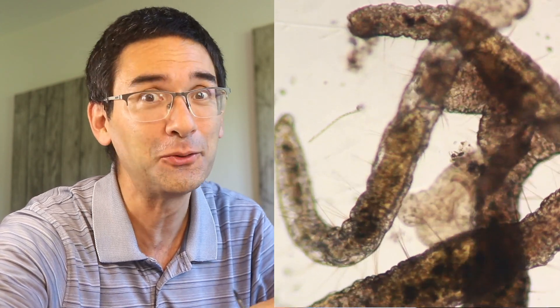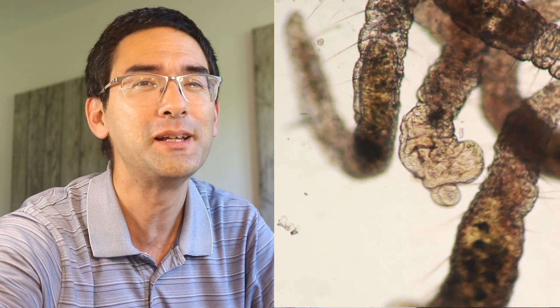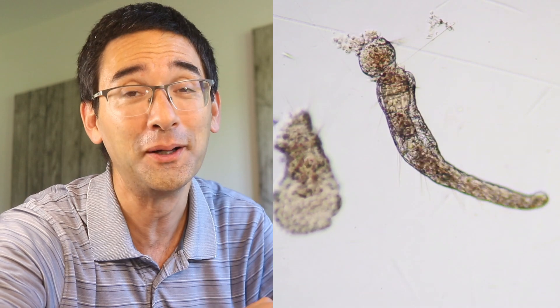Hi, Microbe Hunter here and today I'm gonna do a fun little project. I've got some microscopic worms and I'm going to cut them apart using my surgical knives — and both parts, head and body, continue to live on. Stay tuned and see how I do that.